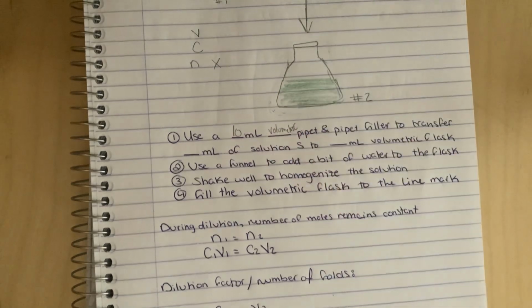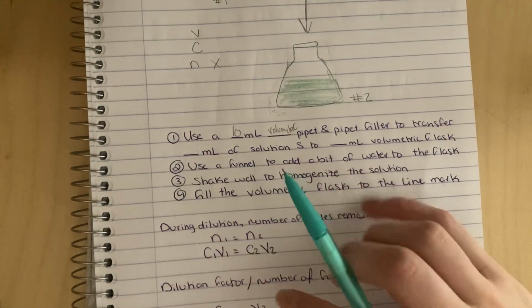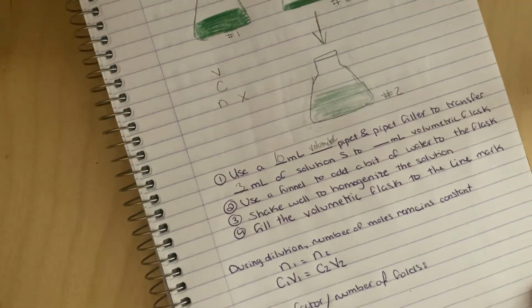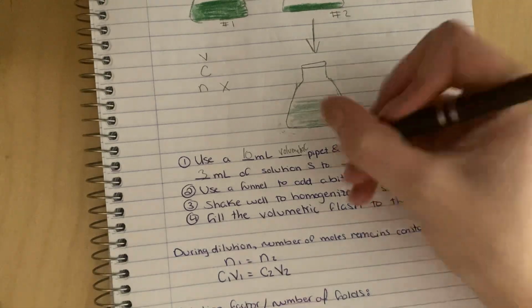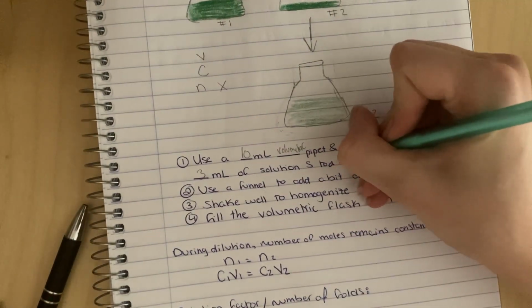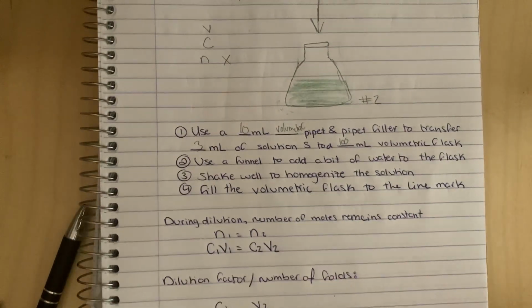I'm gonna make another video on the different glassware. So use a 10 milliliter volumetric pipette and pipette filler to transfer, say, 3 milliliters of solution S to a 100 milliliter volumetric flask. Again, all the numbers that I've written in pencil are based off of the experiment that you're trying to perform.